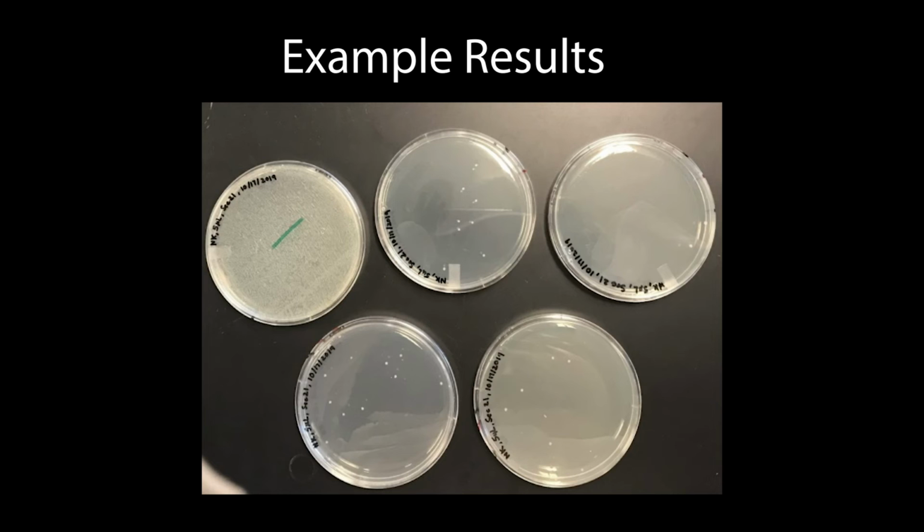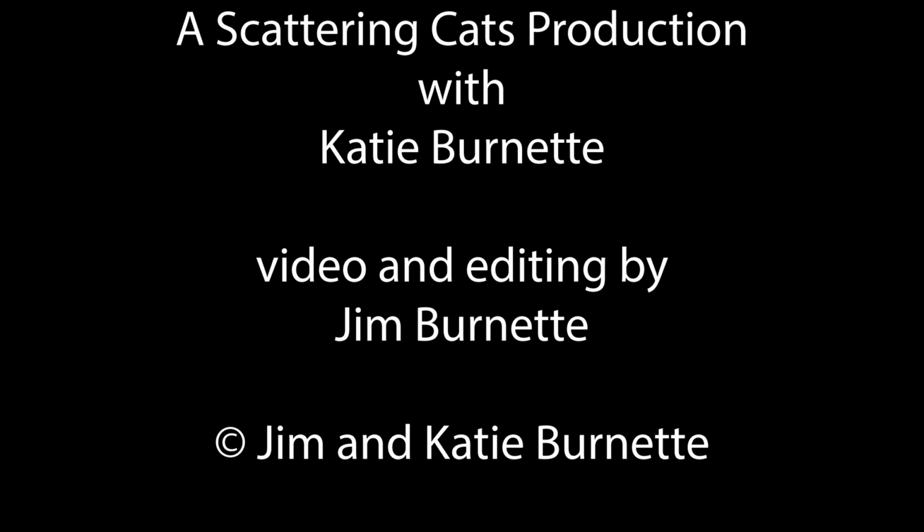The plates are viewed under ultraviolet light to see which colonies fluoresced green. This phenotype is also recorded.